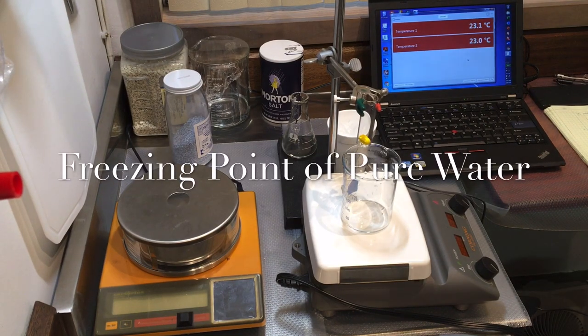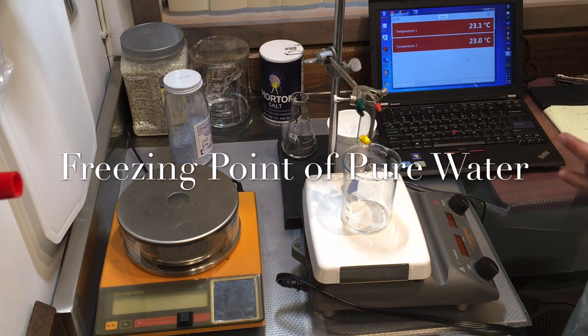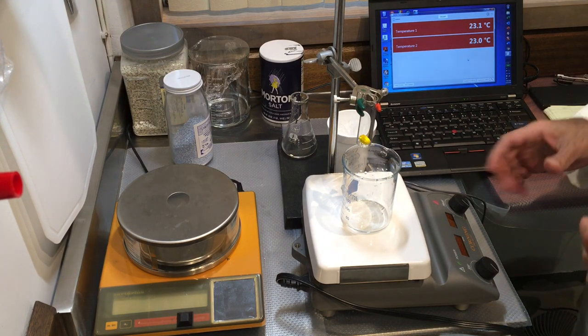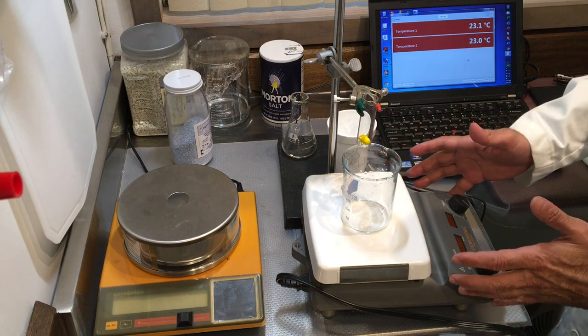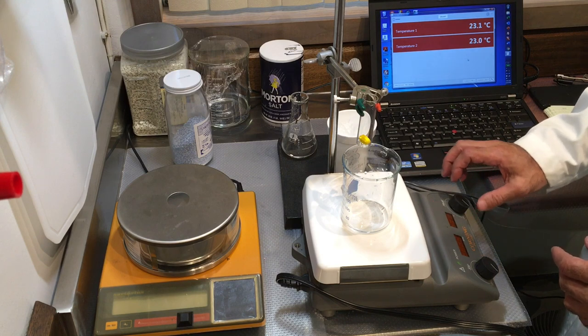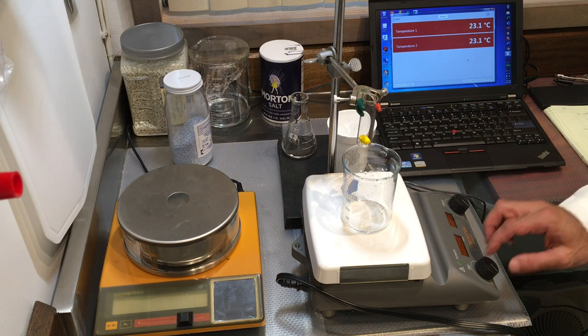Hi everyone, this is Professor Galastana. I'd like to show you the apparatus and equipment necessary for doing the freezing point determination of a solution. I have a hot plate and a magnetic stirrer — I'm not going to use the heat part, just the magnetic stirrer.